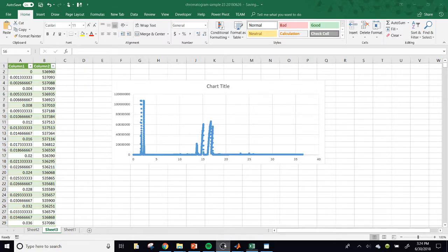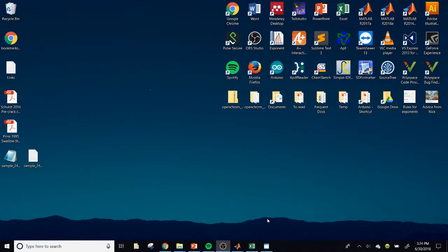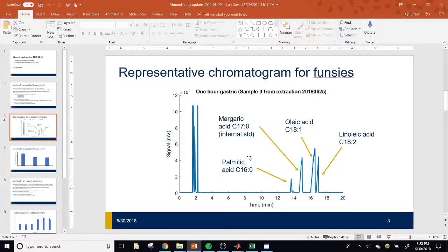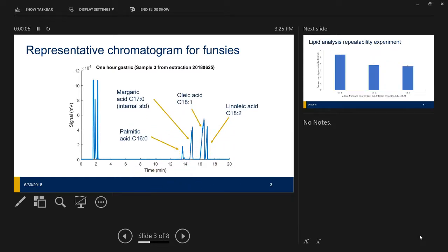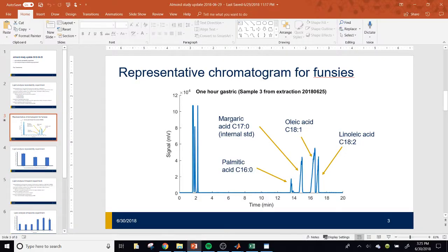All right. I hope that is a quicker answer to the question, how do you convert a file from .raw to .xy or .text, which are file formats that you can archive and open in your favorite graphing utility. The end result might look something a bit like this. You can draw a nice chromatogram in your favorite color, identify the peaks, change the axes and the labels, and so on and so forth.